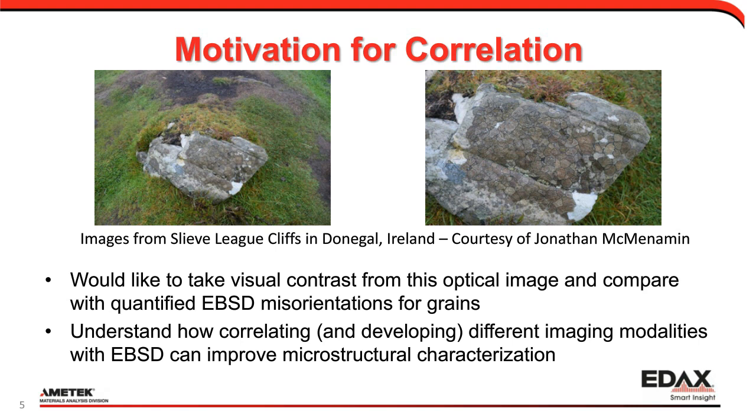And so it kind of got us thinking of, how would you take a sample like this and correlate this image with an OIM map to see, is the contrast we see in one image telling us something compared to the contrast for another image? And so that's just kind of a big picture, fun example of why correlative microscopy is of interest.